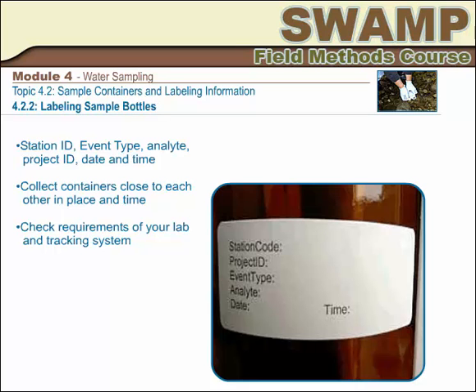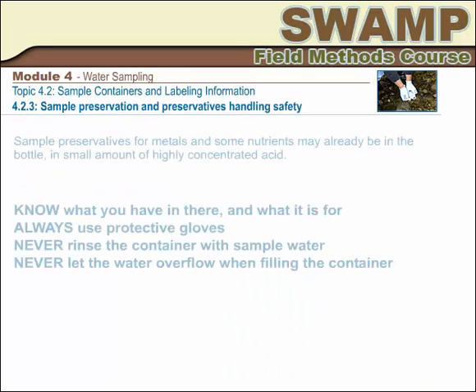Water samples can be preserved to protect certain analytes from changing, being metabolized, or otherwise deteriorating. Laboratories often add small amounts of strong nitric acid to the plastic sample containers that will be filled with samples for analyses of total metals. Labs are required to attach a special warning label to such containers. In other situations, field operators add the acid to the samples in the field after collection.